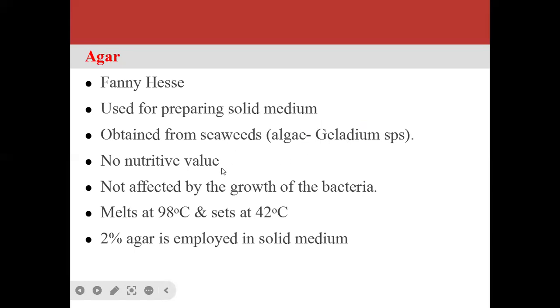And agar has no nutritive value. It doesn't affect the growth of the bacteria, and it is not affected by the growth of the bacteria. Agar melts at 98 degrees centigrade and solidifies at 42 degrees centigrade. It has no nutritive value.